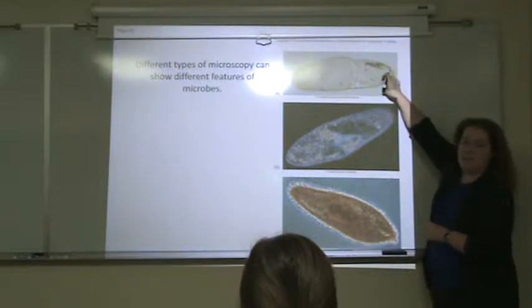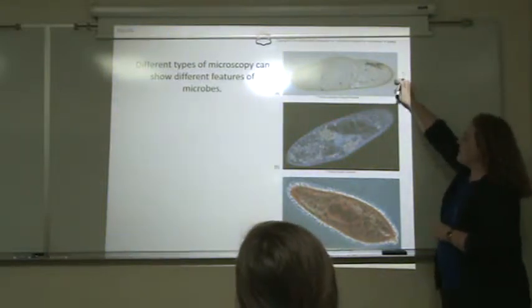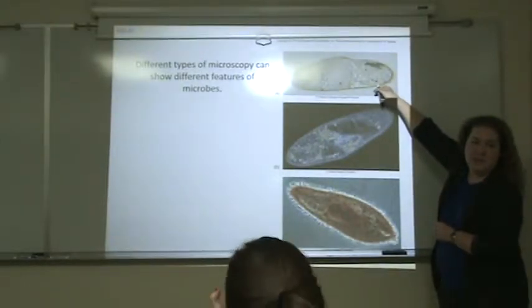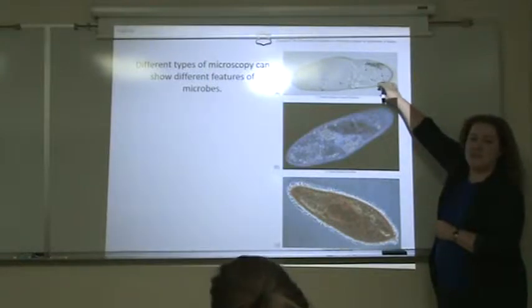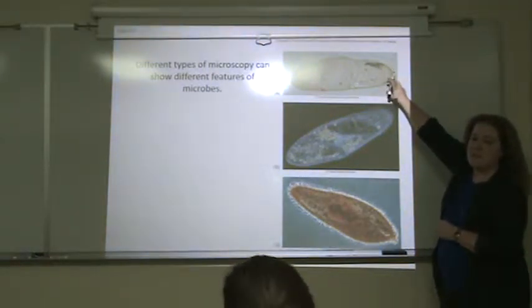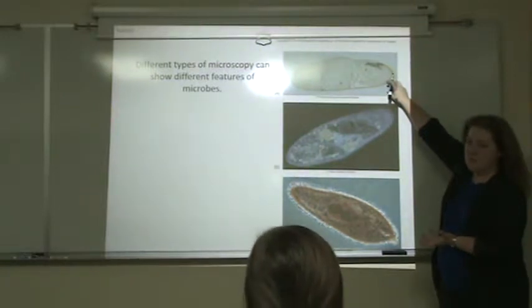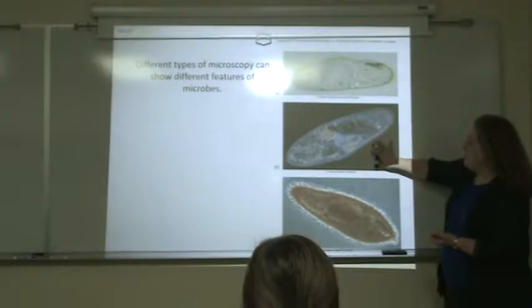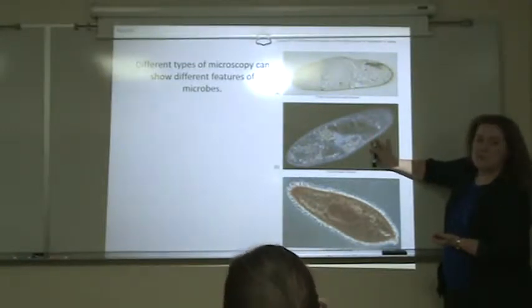So in this picture, this is light microscope, and we're looking at actually a relatively enormous eukaryotic cell here. This is big compared to what we were looking at yesterday. And you'll notice it's clear. And this one is so big that the clearness is not that much of a problem, but it's unstained and live.